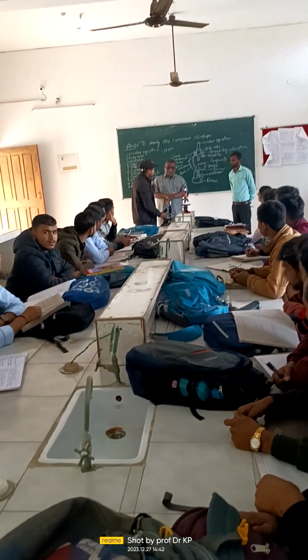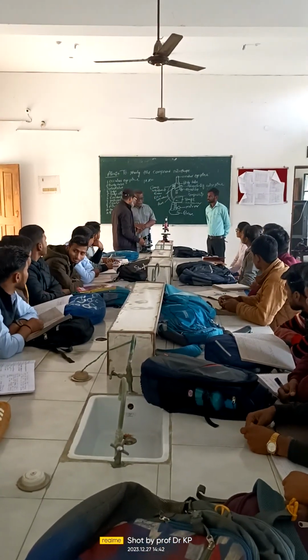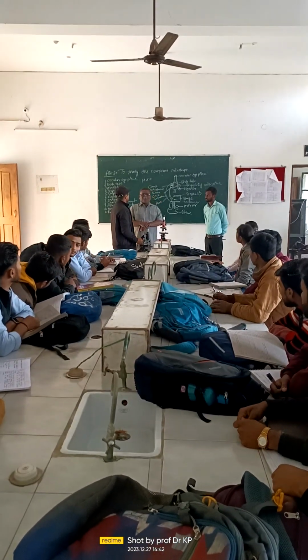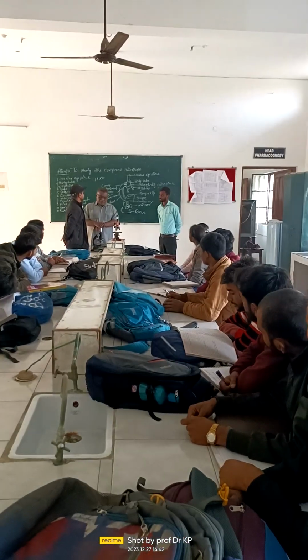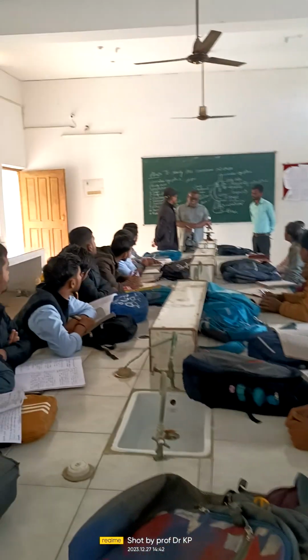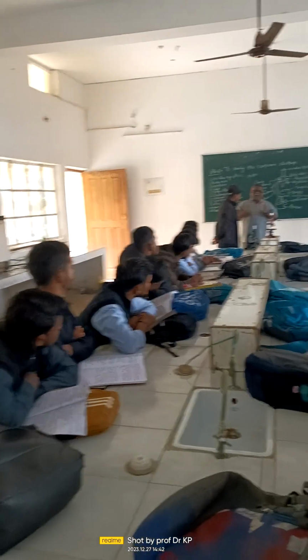Today, your experiment is study of a compound microscope. Study of a compound microscope. So first of all, you all may be knowing what is a microscope. Microscope is an optical instrument used in the laboratory in order to study the microscopic structure in a magnified or enlarged manner.